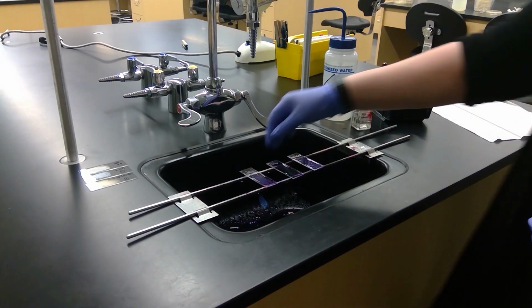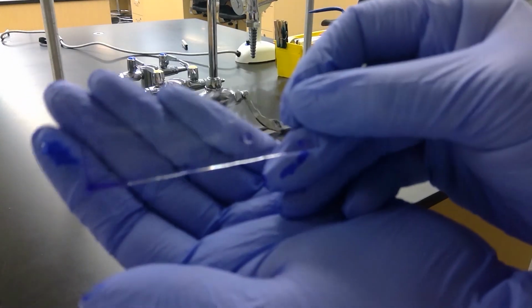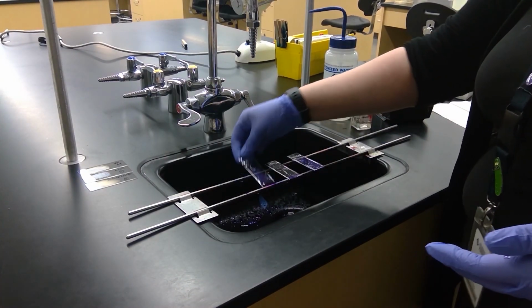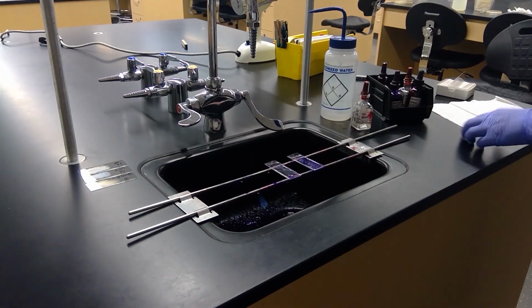So I just wanted to point out that this one, after the decolorizer, isn't purple anymore. But this one retains some of the purple. I'm not sure if you can see that. That will probably help.